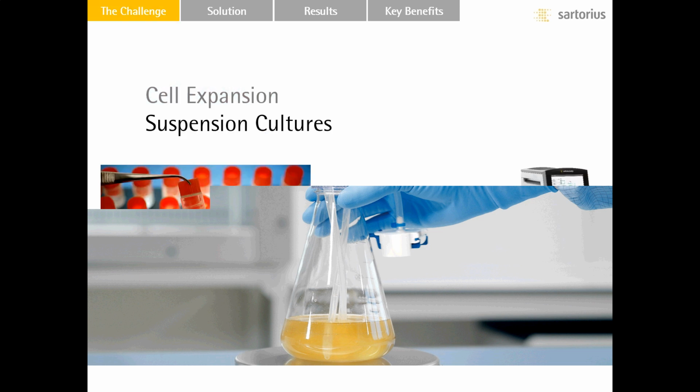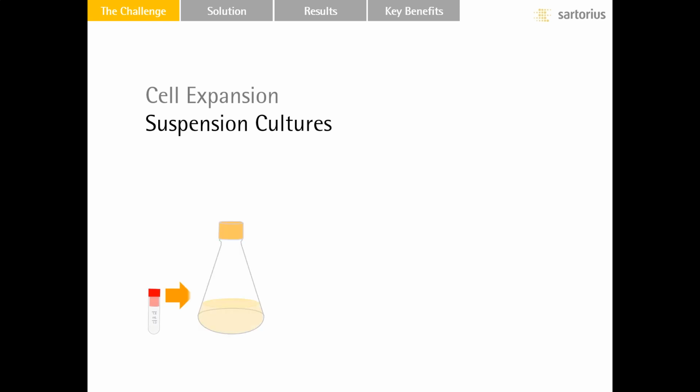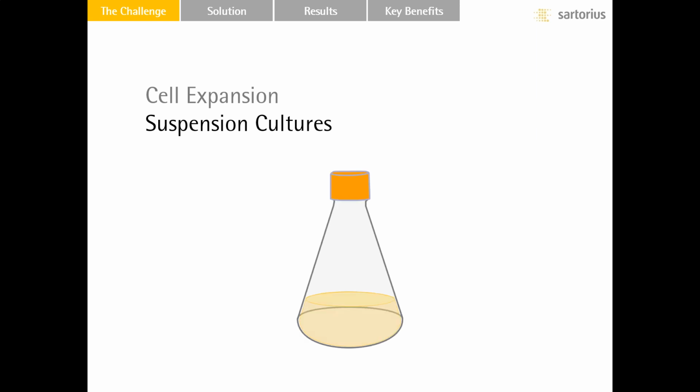Now, almost every cell cultivation begins with a vial of cells from a working cell bank. The goal is for lots of these cells to grow happily in a bioreactor. But of course, the cells from a vial cannot simply be added directly to a seed bioreactor. In the case of suspension cultures, the cells are transferred from successively larger Erlenmeyer shake flasks until the population is large enough to be added to the bioreactor.